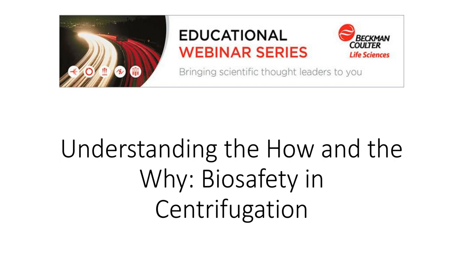I think I like the comfort of seeing the numbers on the electronic balance, but I think that's personal to me. Yeah, I might add also that we have tolerances for each type of centrifuge. So really the balance requirements as spoken during the talk differ depending on the type of rotor, how fast it's run. And so that's going to dictate how careful you should be with balance. But balance is a big issue. Balance is, along with human error, probably the biggest reason why centrifuges fail.